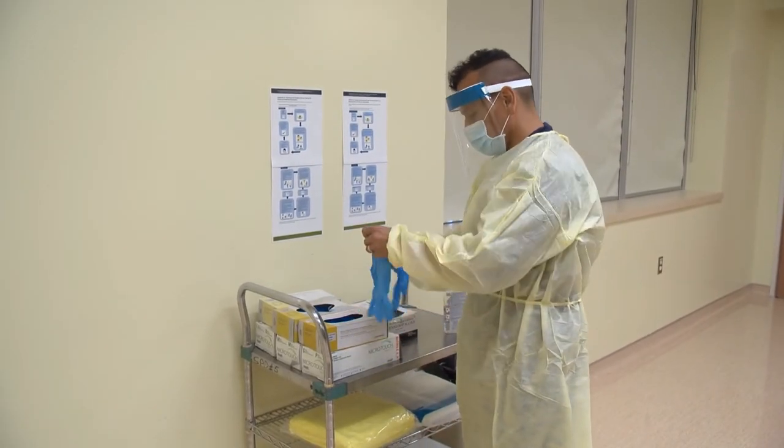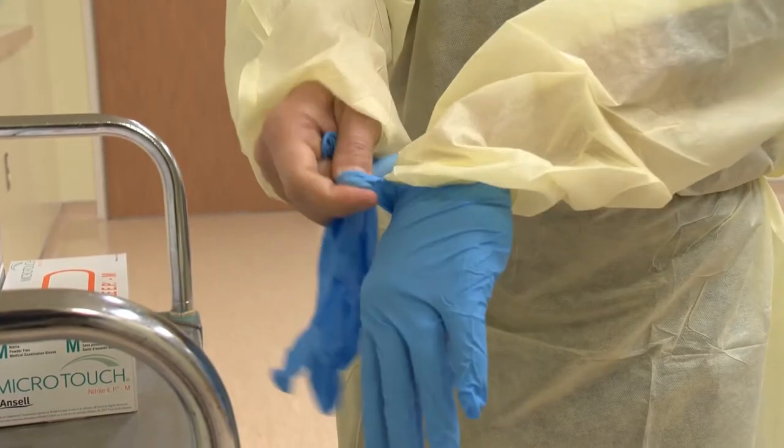Finally, put on your disposable gloves. The gloves should fit over the cuffs of your gown.